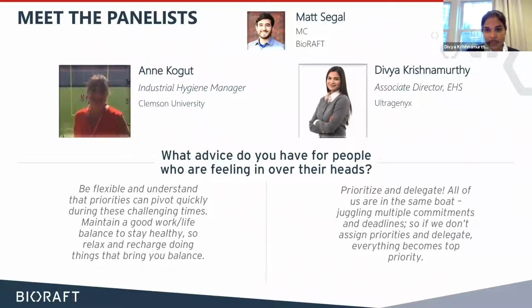Because you do not know what's in your sites. You have people coming in on a kind of staggered shift. And to Anne's point, people who in the past were doing one specific thing are now wearing multiple hats to maximize their time on site, so they can't find where certain things are. Not all chemical bottles have expiry dates listed on them, so you rely on something like a chemical inventory to tell you when the expiration date is for certain items.